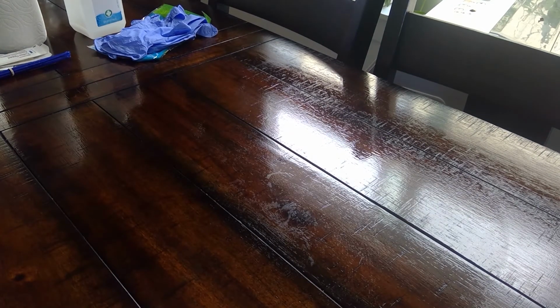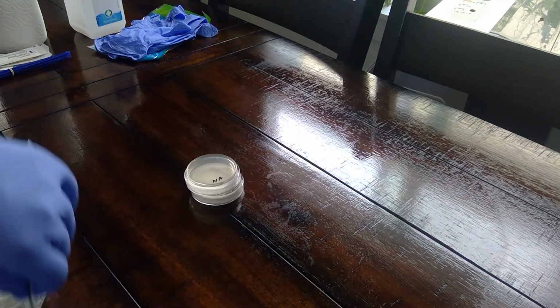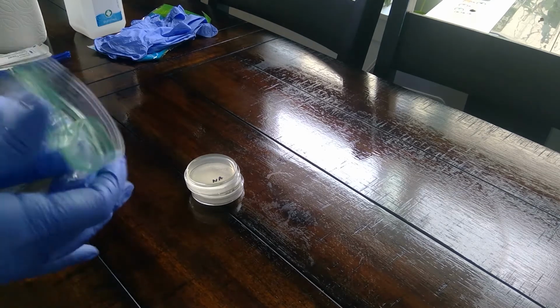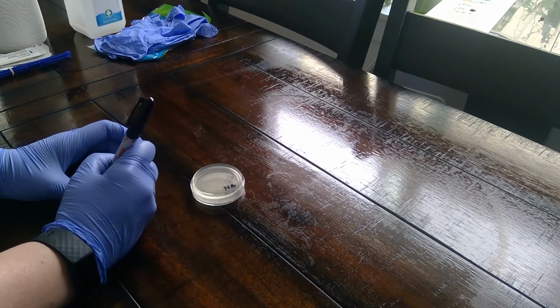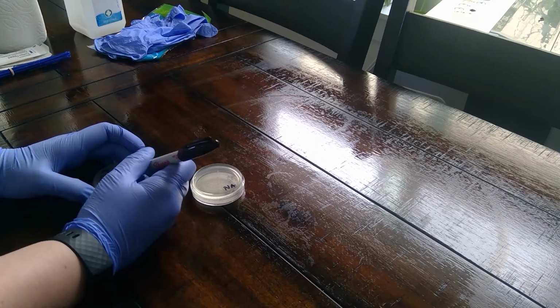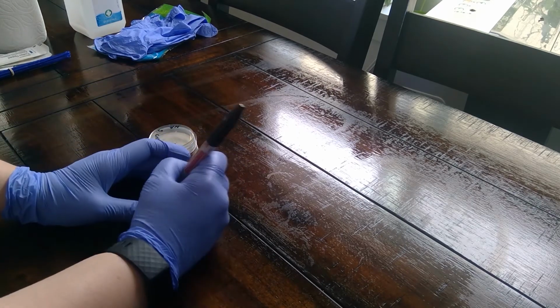Alright, and then step 6, label the agar side bottom of each plate with a permanent marker for the microbe it will contain. So we'll grab 2 of our plates. Oh, and you want to keep as much air out as possible. So the first one is going to be S. cerevisiae, and then the other one will be skin sample.